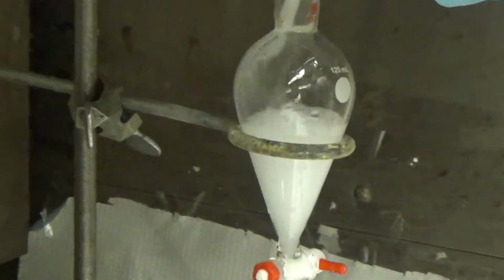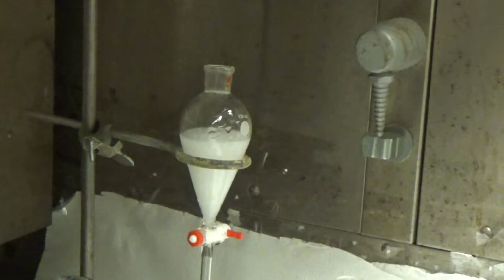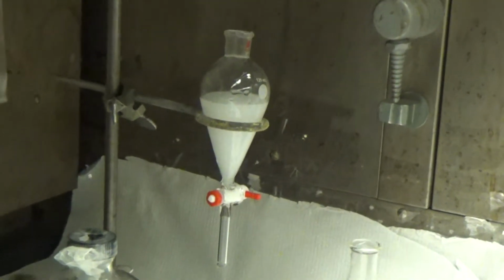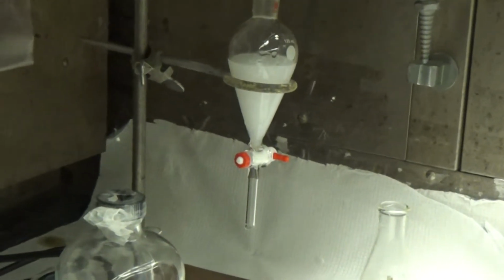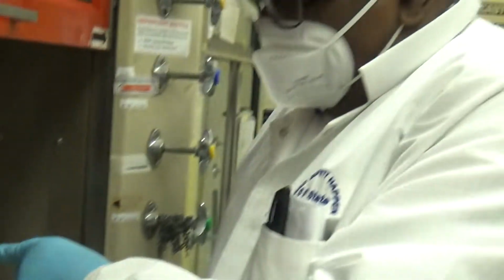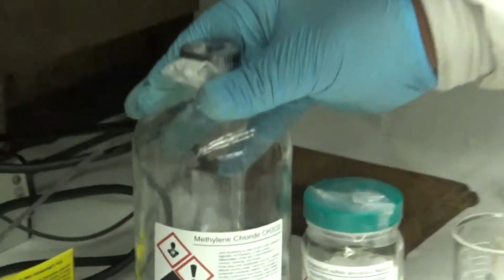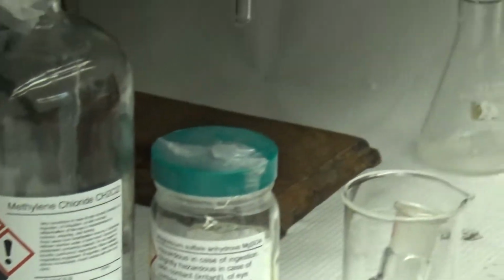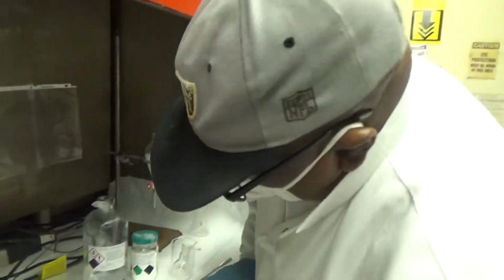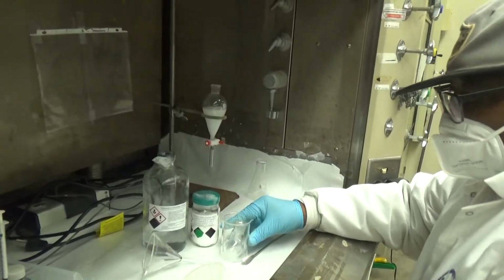So this is a mixture of water and eugenol. Now you know that eugenol is an organic compound. To extract eugenol from this mixture, you will need an organic solvent. And as I said, the organic solvent you are going to use is methylene chloride. I'm going to do 2 extractions, each time with 10 milliliters of methylene chloride. So 10 and 10 is 20 total.